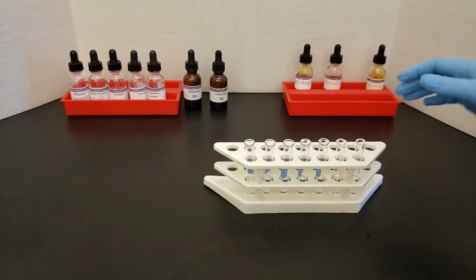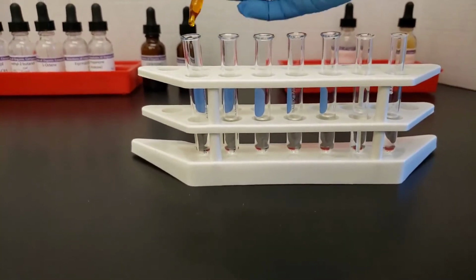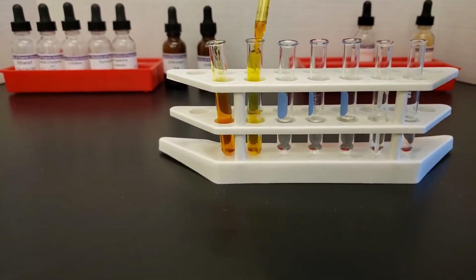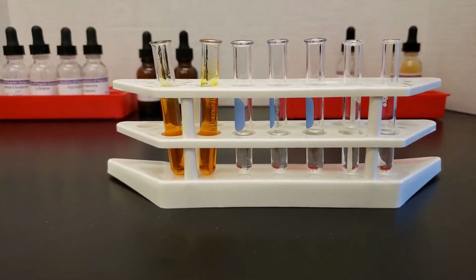Now we move on to the next chemical, also orange. Actually, all of our reagents are orange. This one is called Brady's reagent, and it's dinitrophenylhydrazine.